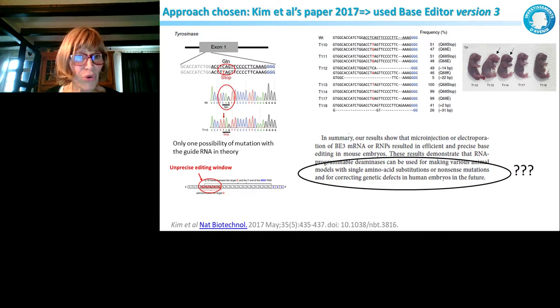Again, I remind you what is published, the editing window. And then we took the same guide RNA and generated DNA. First I show you what they showed, and they showed that indeed they obtained the T. Some look correct, but you can already see here that some mutations are not the ones that are expected, okay? And that there is not a C, but it's transformed to a G in the paper. And sometimes you can also see in the T112 that you can have indels, which is not great if you think you would use that for therapy.